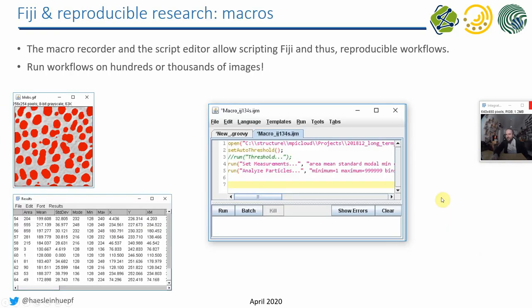Because all this clicking takes time, there is the ImageJ macro language, which allows you to automate all of that. The steps just shown are actually a five-line program that does exactly the same thing. You will learn in the third lecture how to do this yourself.